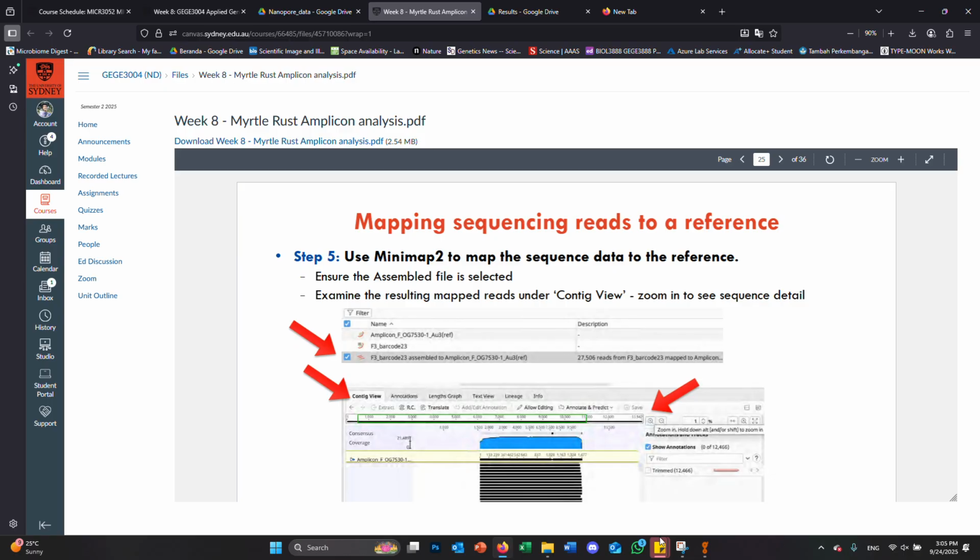You can select your assembled file. So you'll need to go to the one, sorry, my drop down bit has hidden it, but it's the one that has assembly in its title. Go up to the tools and all the way down to generate consensus sequence. For this, I'm just saying keep the defaults.